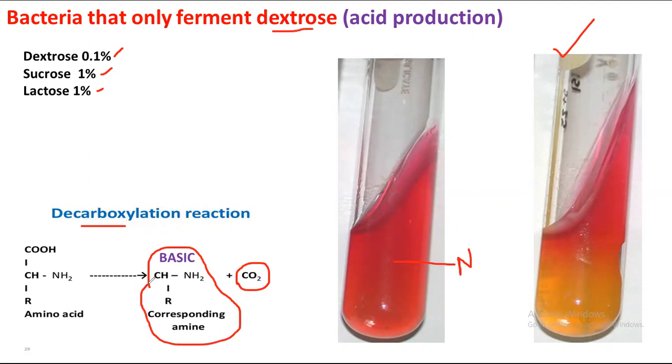Continuously, when the bacteria are dividing, they are producing amine. And the bacteria that ferment are also producing acid due to the fermentation. So at the same time acid is being produced, and bases, the amines, are also being produced. But the acid is in a bit higher concentration.